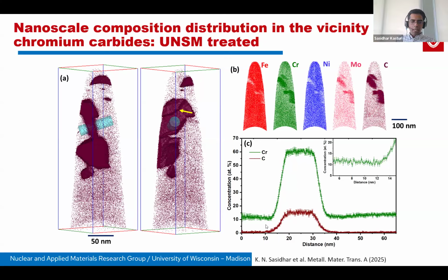No. We did measurements even away from the carbides, and the chromium content is very homogeneous. There's no clustering or anything like that occurring. We tested for it, and statistically we don't see any clustering. I wouldn't expect that in this material from a thermodynamic point of view. It is stable.